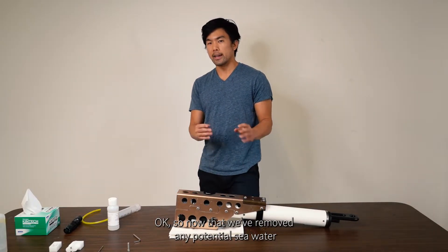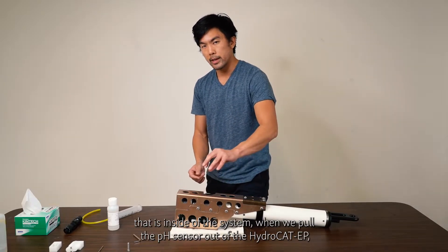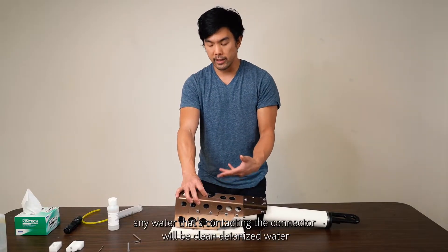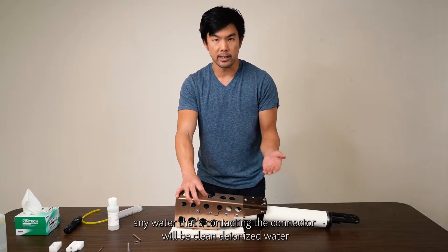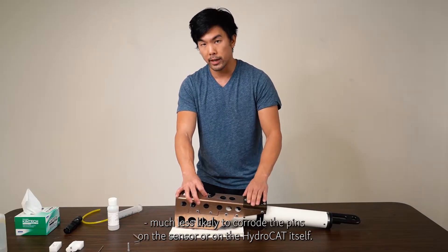Now that we've removed any potential seawater from inside the system, when we pull the pH sensor out of the HydroCat EP, any water contacting the connector will be clean deionized water — much less likely to corrode the pins on the sensor or on the HydroCat itself.